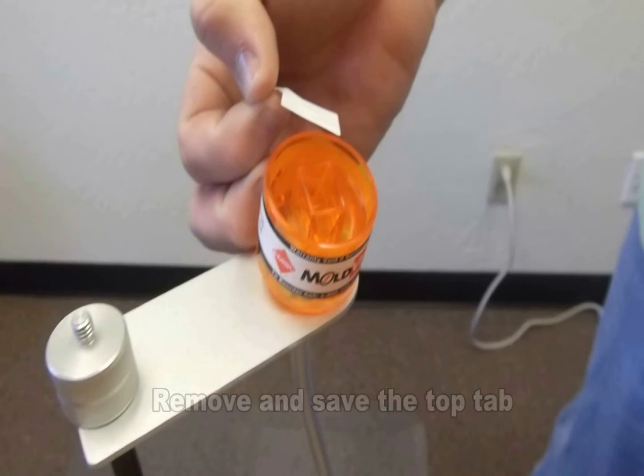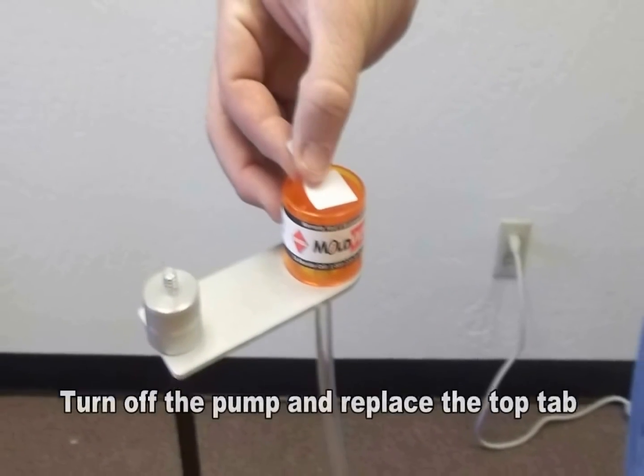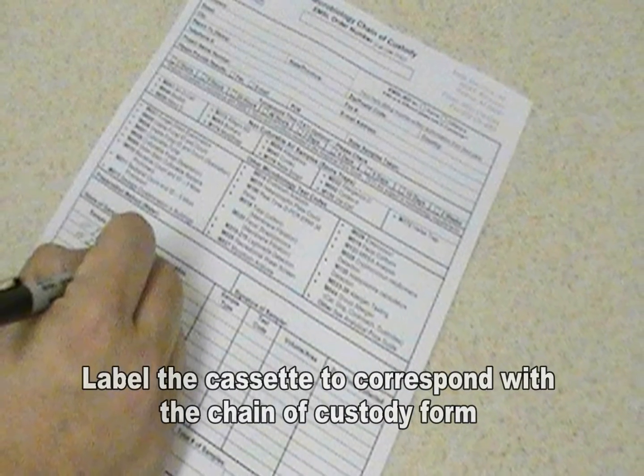Then remove the top tab and also keep this for later use. Turn on the pump and begin sampling. When complete, turn off the pump and replace the top cassette tab. Remove the tubing from the bottom of the cassette and replace that tab as well. Label the cassette to correspond with the sample number on the chain of custody.